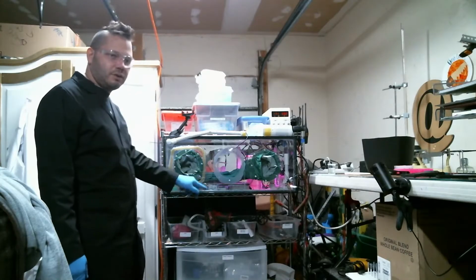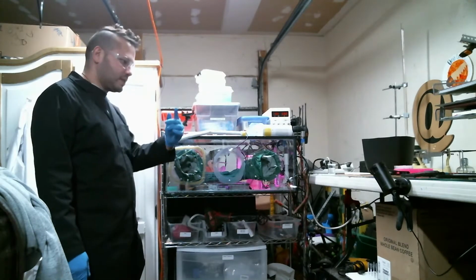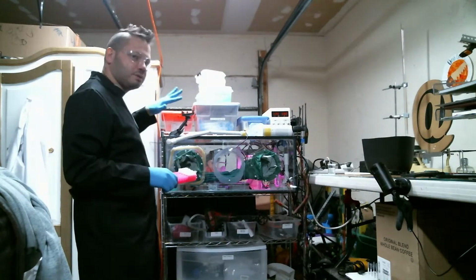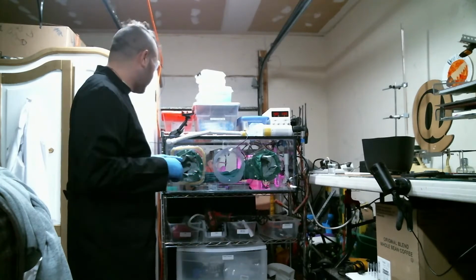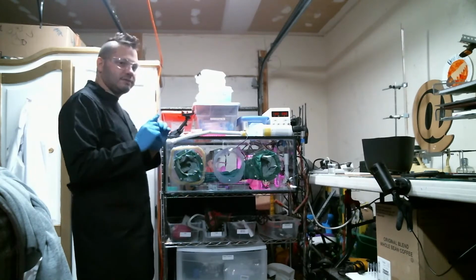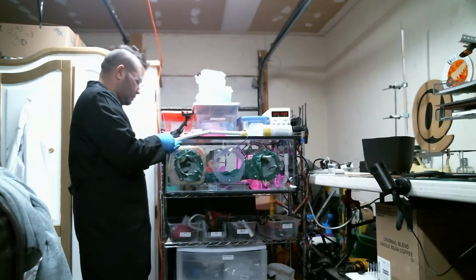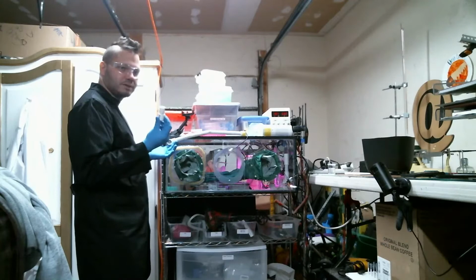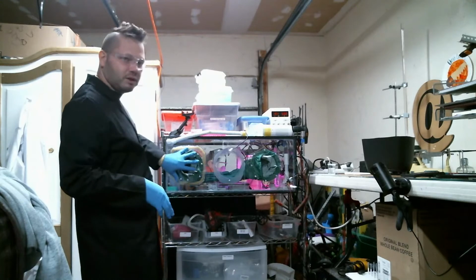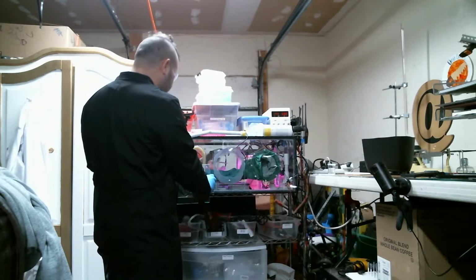Now this glove hole actually comes off. There are 4 wing nuts that I can take off, and that's how I'm going to put the seeds in there. Every once in a while, the reason the alcohol is in there is so I can sanitize all the surfaces. But one thing it also has, so I don't have to go through this process all the time, is that when I do my algae counts, there's a little thing right here that opens up, and I can send the sample through there without opening all of this. I only need to use this if it's a large sample that I need to bring in or out.